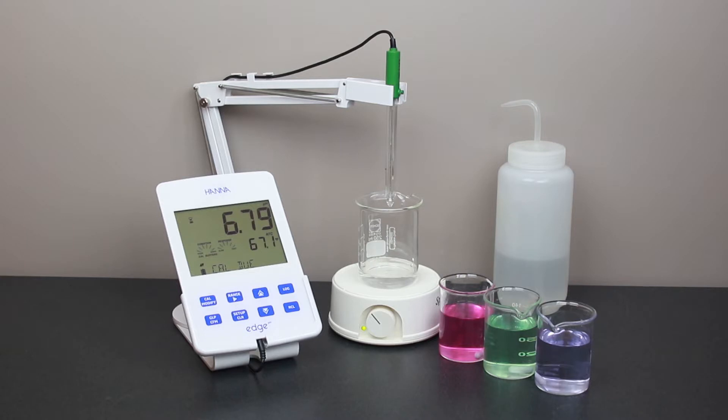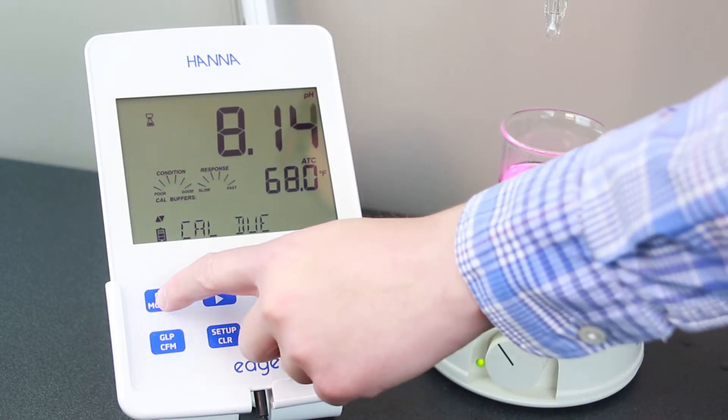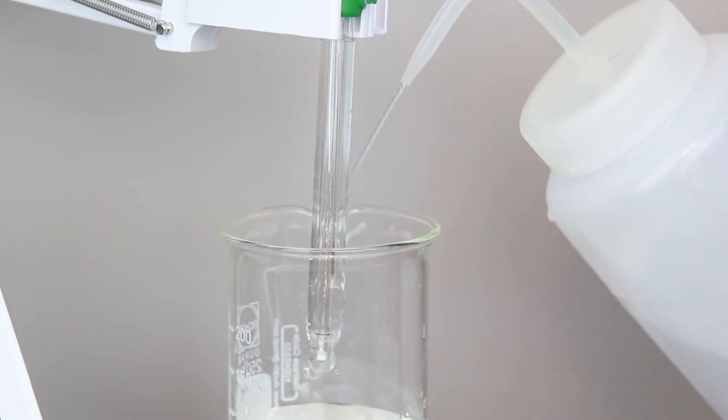To calibrate your meter, first fill your beakers with your calibration buffer solutions. Now with the meter turned on, press the Cal Modify button to enter calibration mode. By default, the meter asks for pH 7.01 buffer first. Use the arrow keys to move the first calibration point to pH 4.01. Before placing the electrode into the first buffer, rinse it with deionized water.